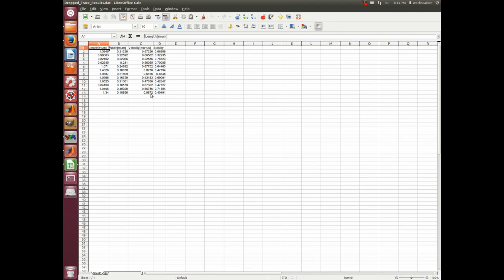So let's get that in here, and the same data are displayed here: filament length, filament width, and the filament velocity. And again, we could go and say here we want the average and put all this in here, and we end up with an average number.